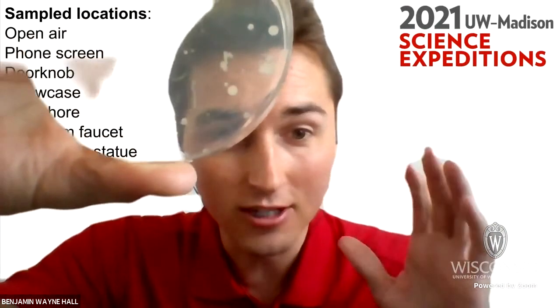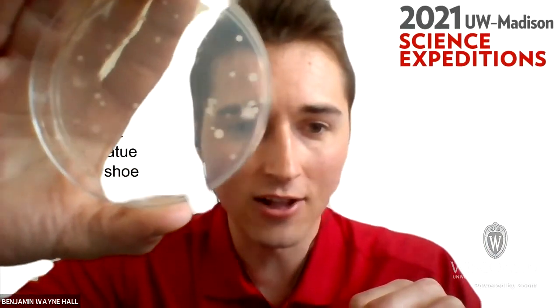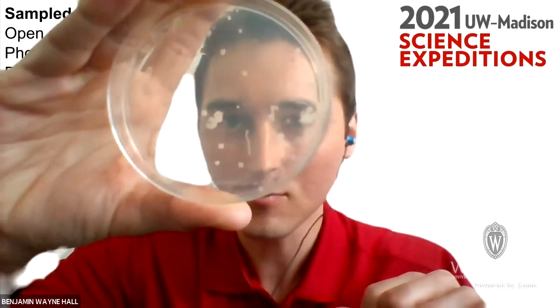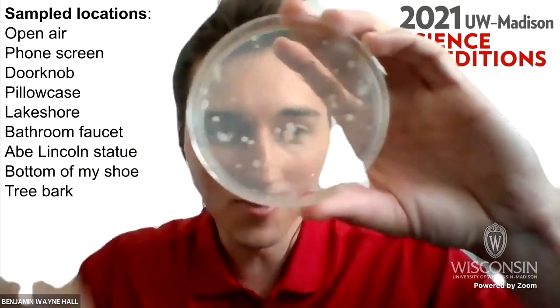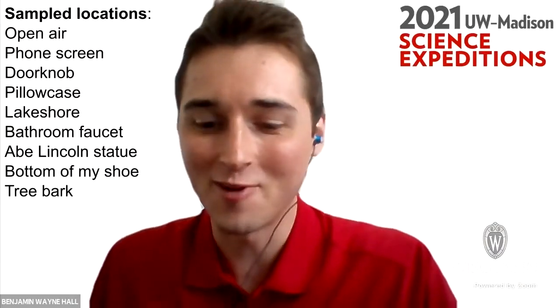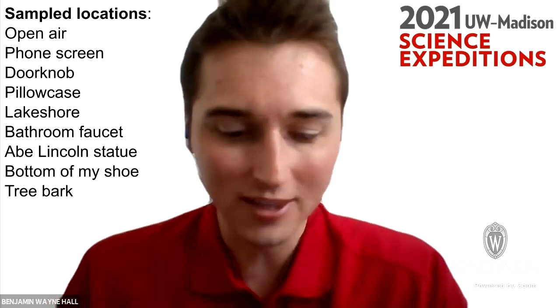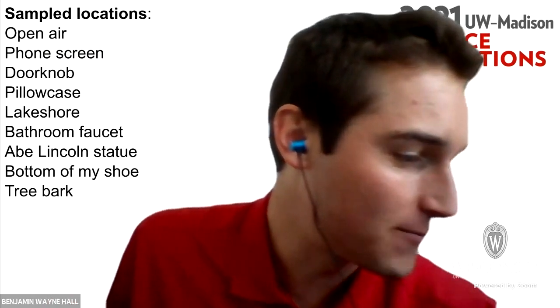Even though they're the same color, they grow in different ways. So that's another way that we can tell different bacteria apart. So the bottom of the shoe definitely looks like I've been walking around in many different environments. So that's a fun one. And we can look more at this plate if people have questions or want to go back to it.